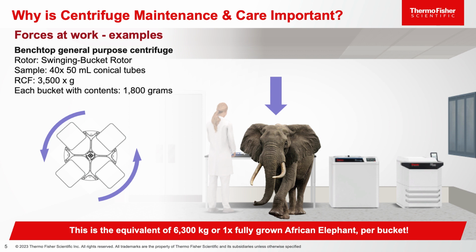The forces get even greater when you move into super speed or ultra speed centrifugation. Now imagine if that fully grown African elephant gets out of control and goes crashing through your lab. Can you imagine what type of damage this would potentially cause? That's why we stress the importance of maintaining your equipment.